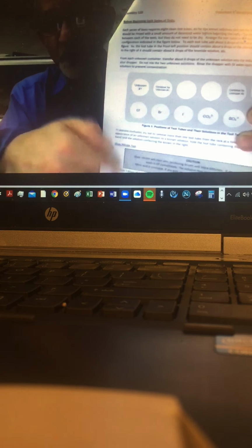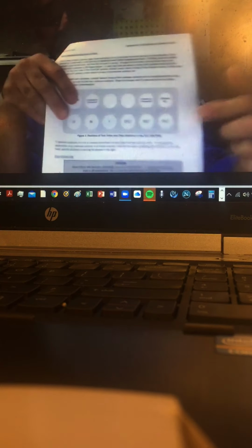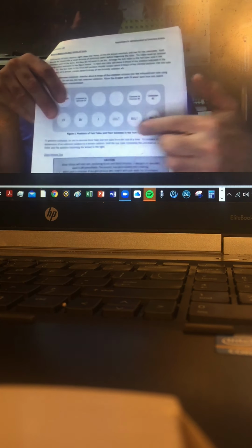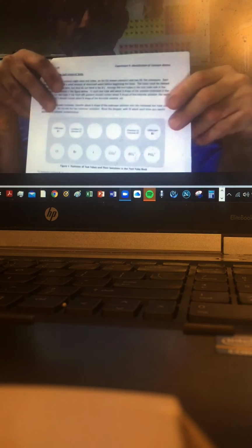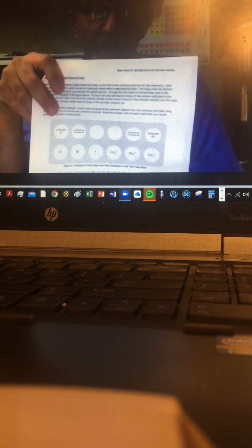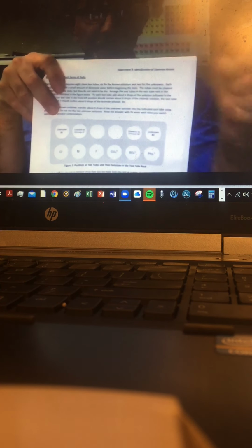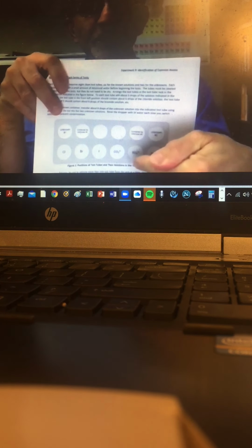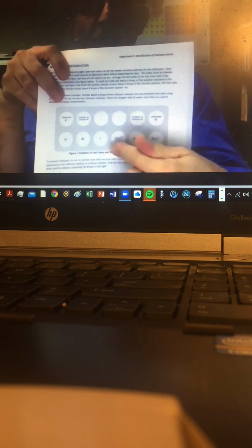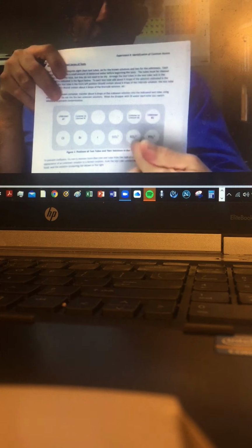We will take water on that. The second one, okay, we'll just test that. We'll test the polyatomic ions, those selected ions, and that test is called the barium chloride test. That will expose, specifically, just one thing: sulfate. So the barium chloride test is going to expose this polyatomic ion, the sulfate.